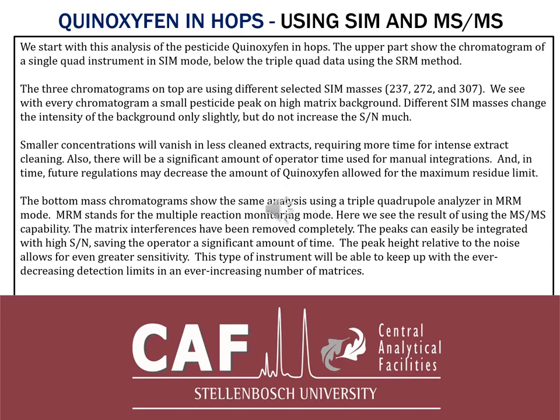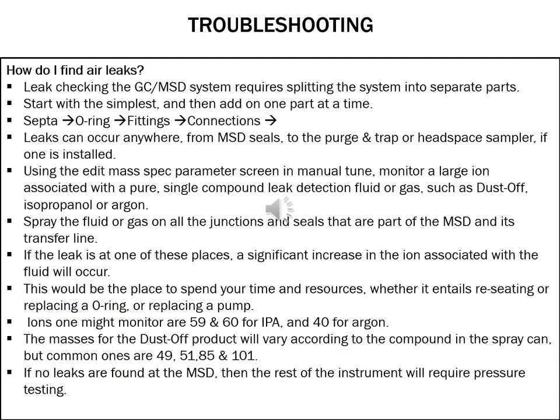This slide here explains the previous slides about the quinoxyfen, for the SIM on the single quad, and for the MS/MS on the triple quad. It's self-explanatory. The remaining slides from this one where we are now, I think it's 45 up until 48, are some troubleshooting guide for you when you're experiencing problems.